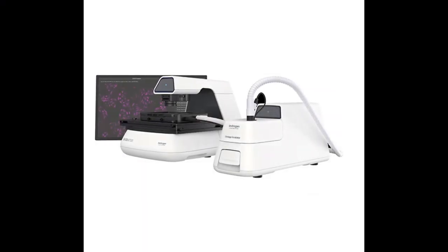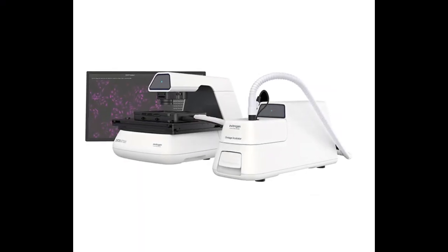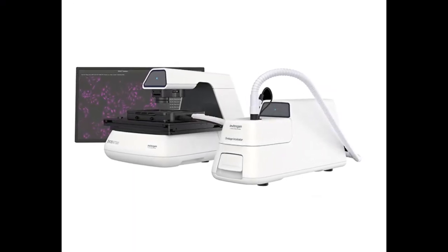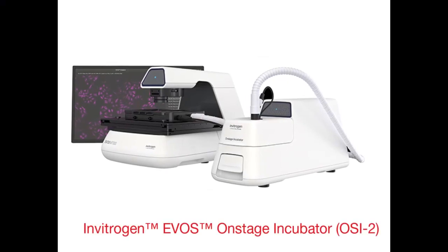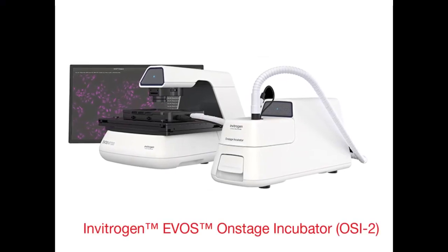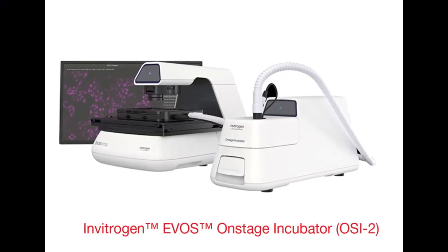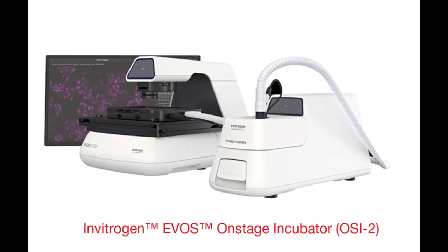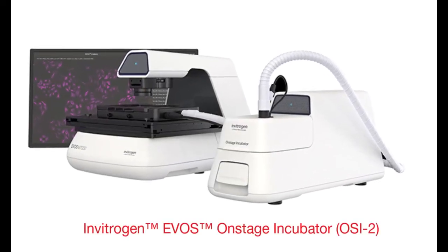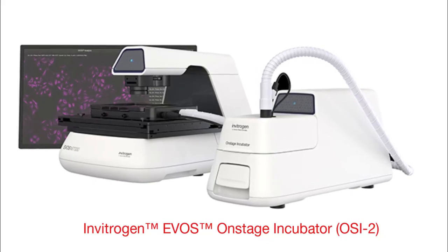This video covers the general user operation of the EVOS onstage incubator following installation by a qualified Thermo Fisher field representative.